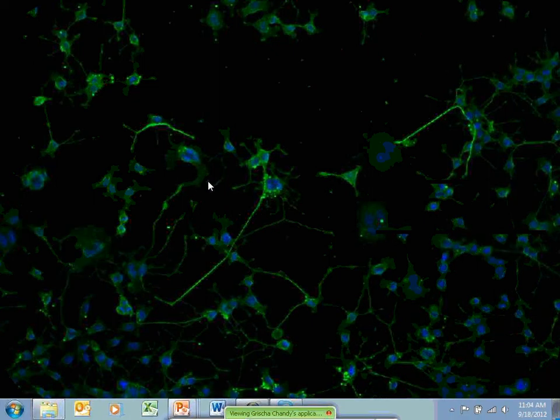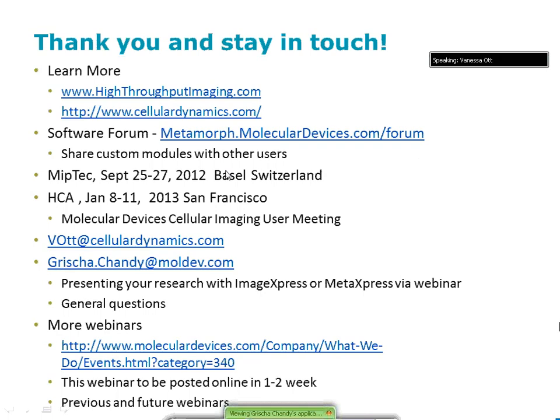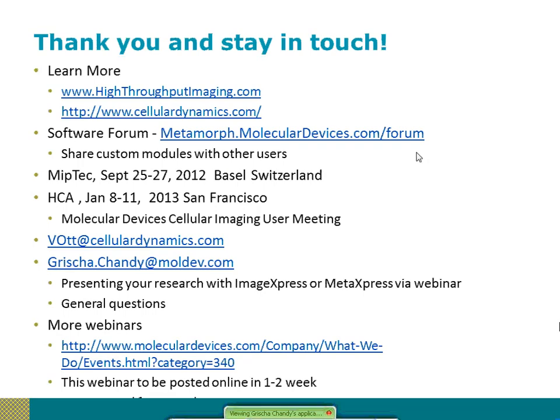And then to the other question I thought you were asking first, one of our partners, our collaborators at Drug, have also done an interesting hepatotoxicity study comparing the iPSC-derived hepatocytes to results that they obtained in primary hepatocytes from a variety of different species, as well as some in vivo dog data, and they found significant compounds responded similarly in the human iPSC-derived hepatocytes compared to both the primary hepatocytes of the species as well as the in vivo data. So that may not have been the question that was asked, but I'll answer it anyway.